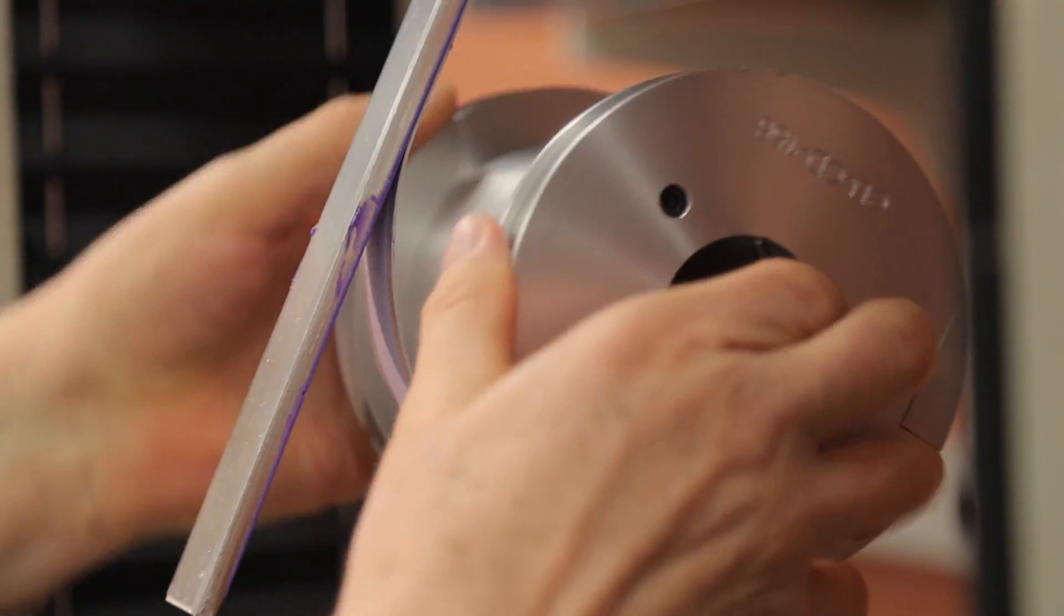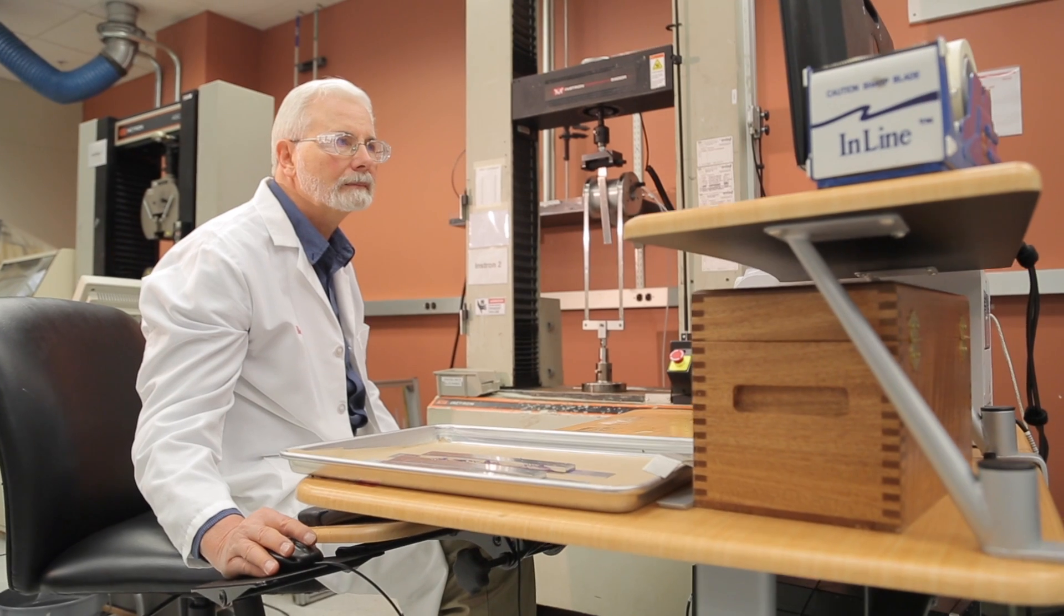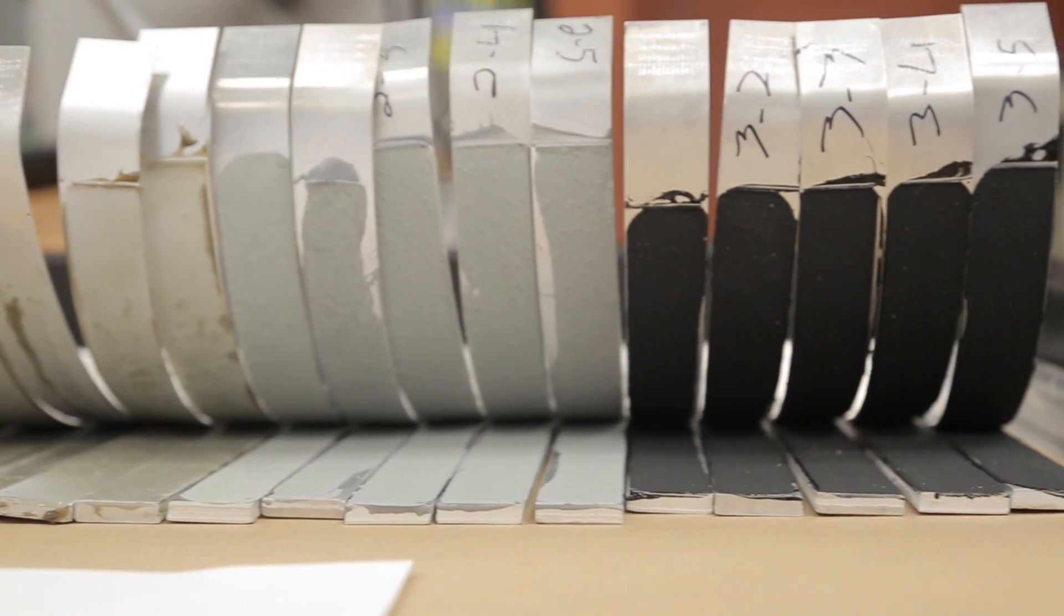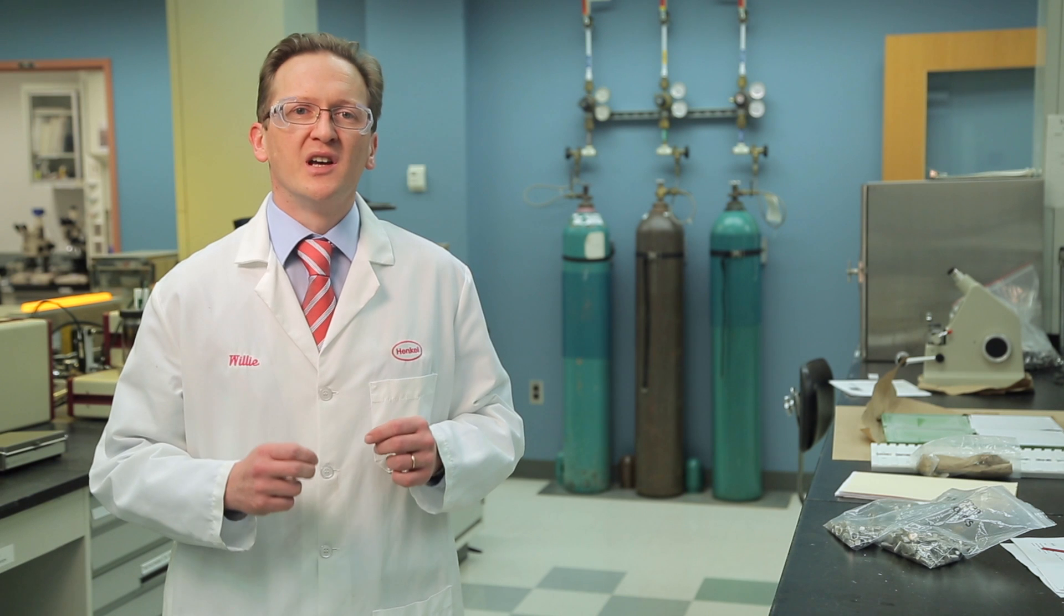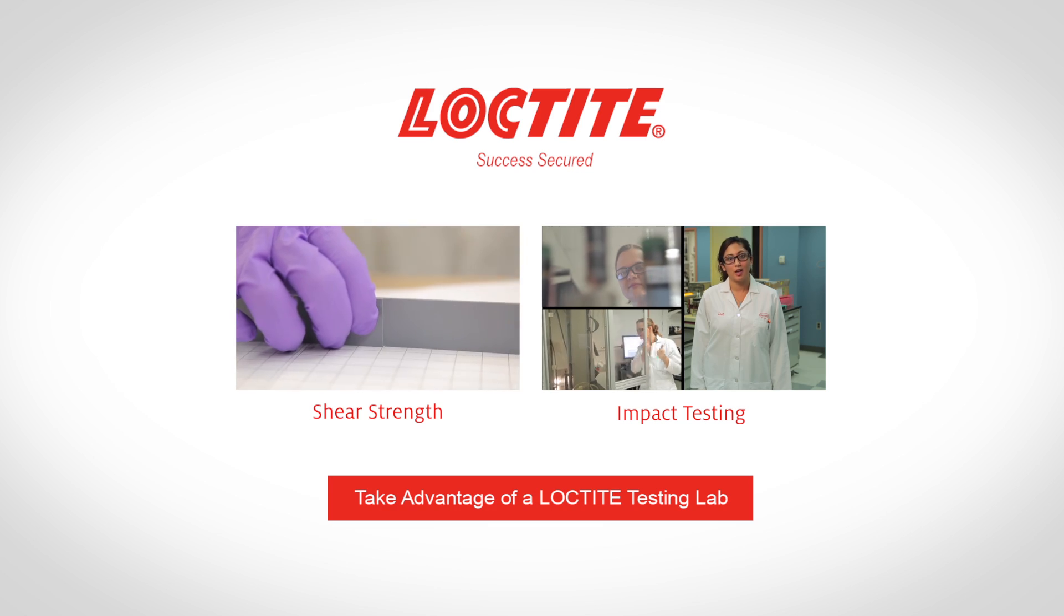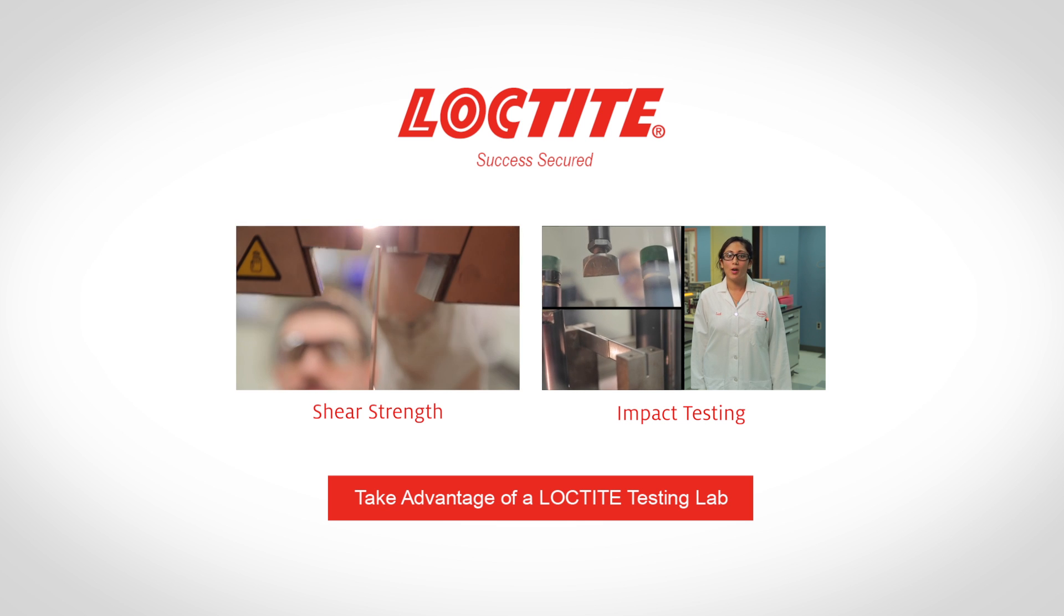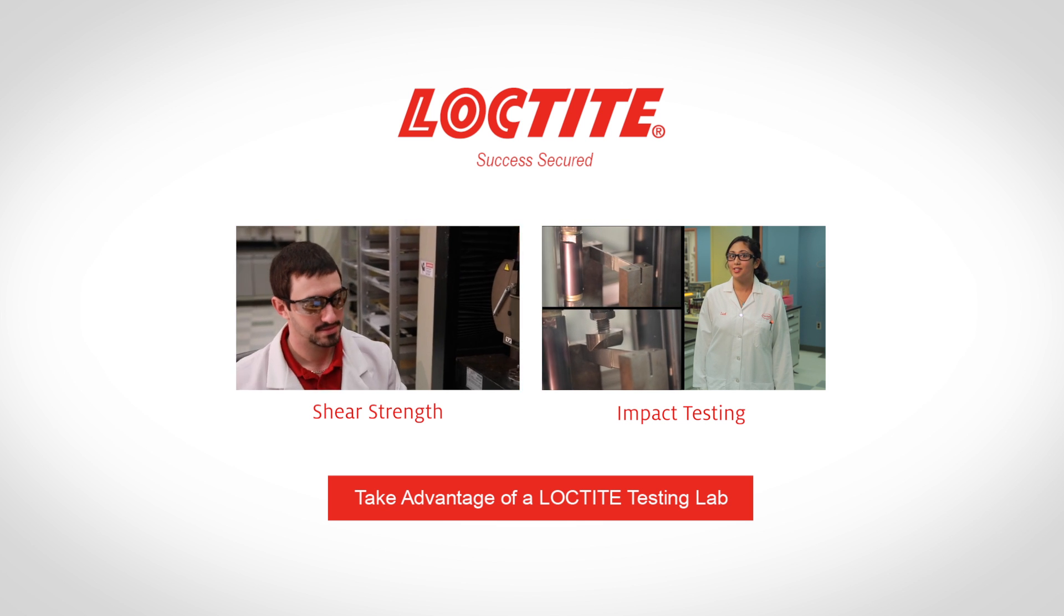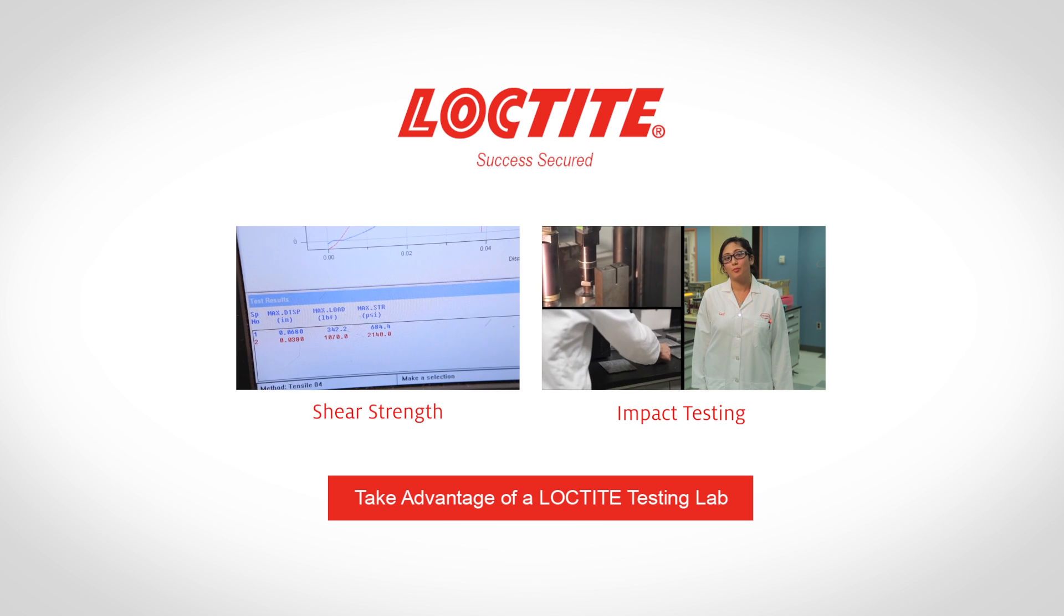This peels the flexible substrate away from its rigid mate. The test can be run using only the flexible substrate and this value is subtracted from the combined result to provide the peel strength of the adhesive alone.